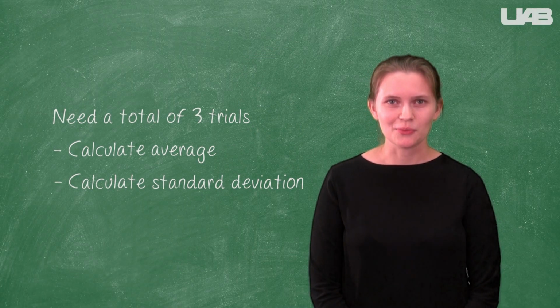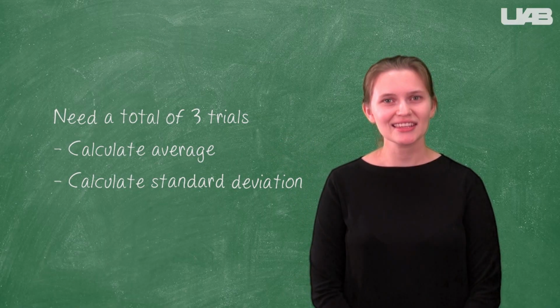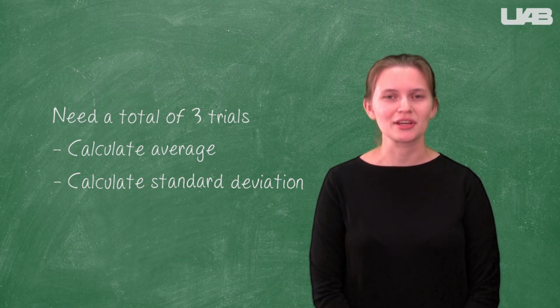Once you find an amount that works, repeat the procedure for a total of 3 trials so that you can calculate an average and standard deviation for your results.